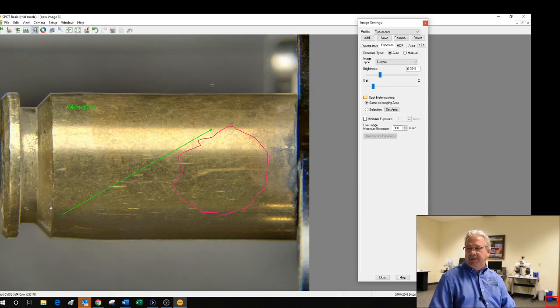Those are kind of the highlights of features. Obviously, there's a lot of other information and functionality based in this program. But again, my experience has been most of you have a big backlog. It's important that you take pictures to show that you looked at things and saw things, but if somebody really needs detailed information, you've still got the evidence and they can pull it out and take a look at that. So are there questions, suggestions, things that people didn't understand that I could address or answer right now?